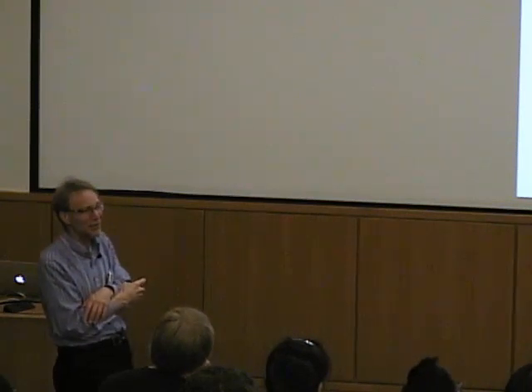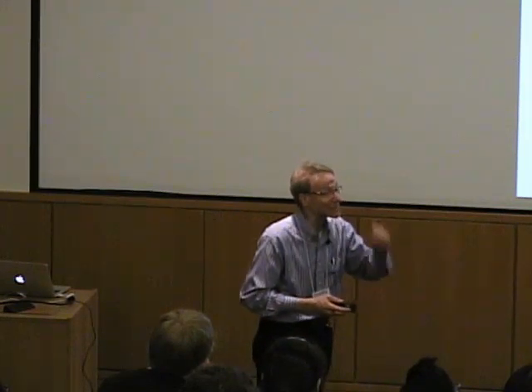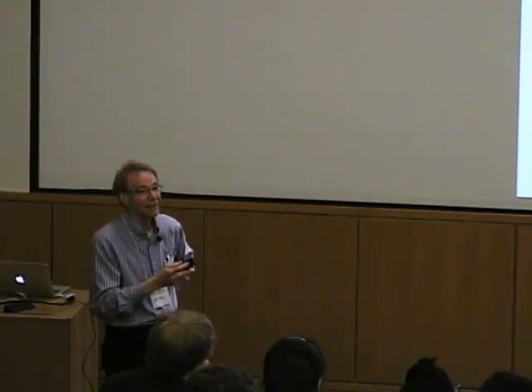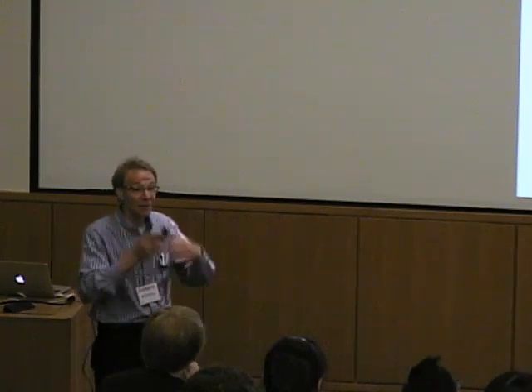Whoa! Not so straightforward, right? Well, I see 3 inflections here, right? The EDTA is chelating out 3 different populations of these lead ions, right? Sequentially. And that's what this data is telling us. So how are we going to analyze that? Well, we work with a kind of a limited set of data of fitting protocols, but we in fact were able to use them in a unified sort of way.